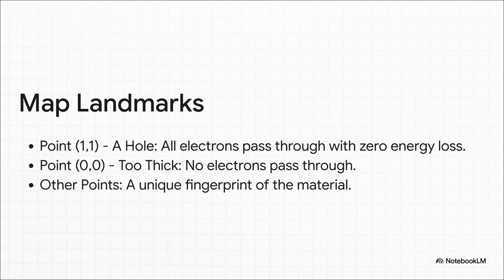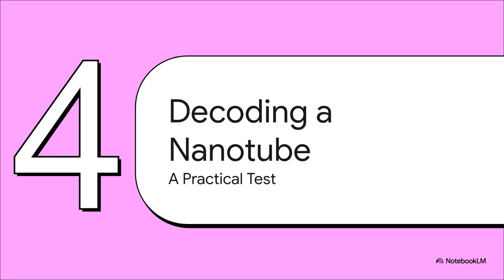And all the other points, everywhere else on this map, that's the good stuff. Each one is a unique signature of the material's thickness and composition. It's the fingerprint. Okay, so that's all the theory. But does it actually work in the real world?